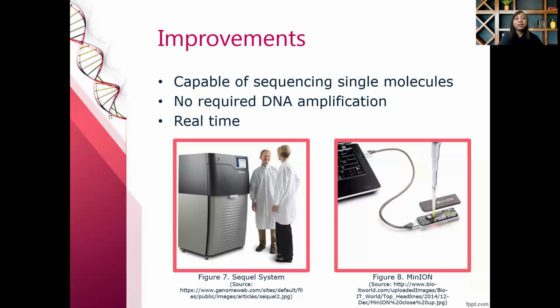The last advantage is accuracy. Repeats are intrinsic to next generation sequencing, as each read is amplified before sequencing and because it relies on many overlapping reads. So each section of DNA or RNA is sequenced multiple times. Also, because it is so much quicker and cheaper, it is possible to do more repeats than with standard sequencing. More repeats mean better coverage, which leads to a more accurate and reliable sequence, even if individual reads are less accurate.